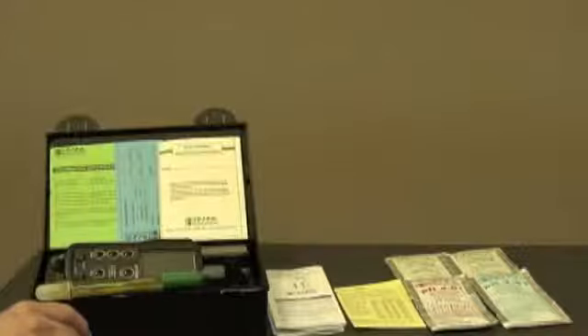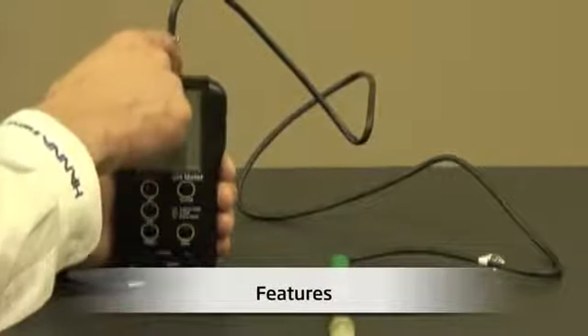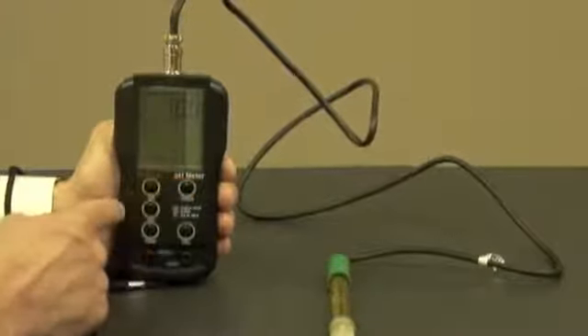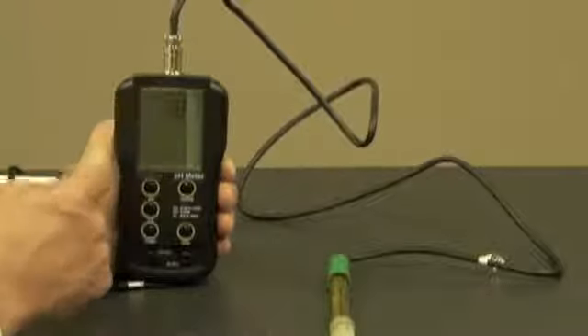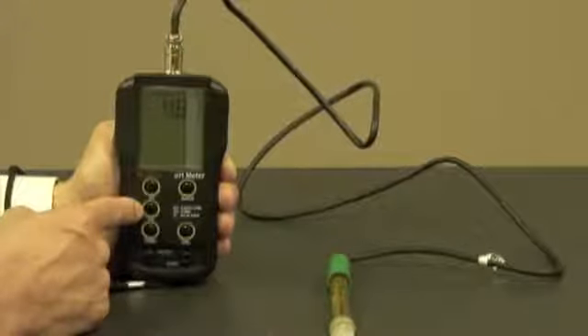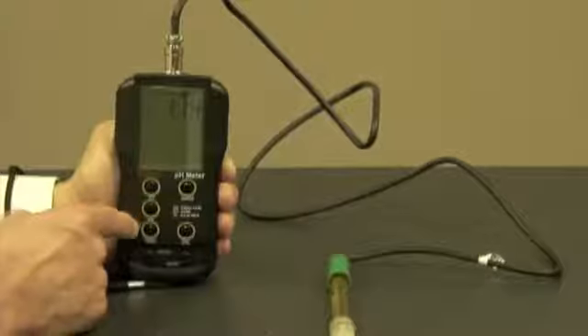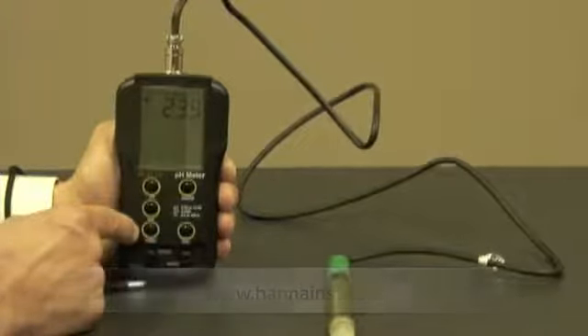Let's talk about some features. Now that I've installed the batteries and connected the probe, I'm ready to turn the meter on. The first thing I'm going to see is the battery indication level, followed by the pH reading. If I want to see the pH reading in millivolts or connect an ORP probe, I simply hit the millivolt button. If I want to see the temperature, I hit the temperature button, which displays in degrees C.